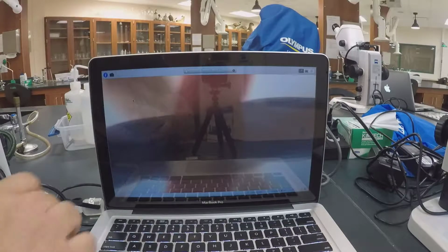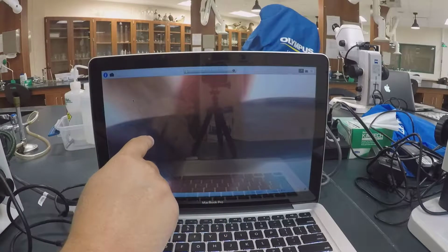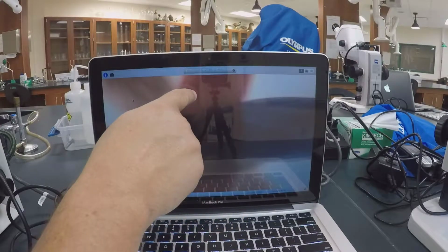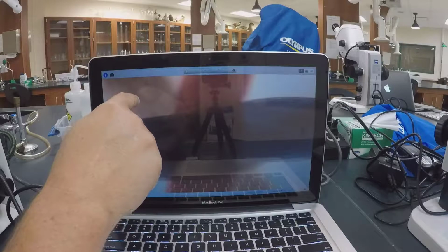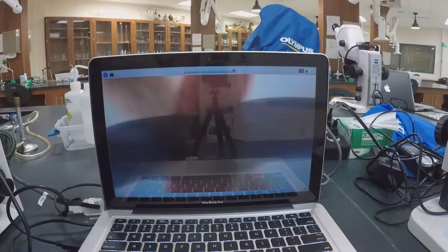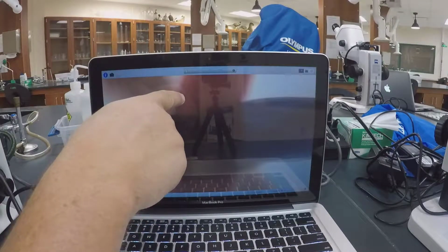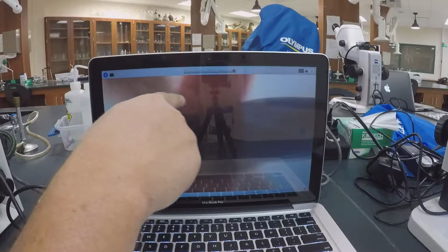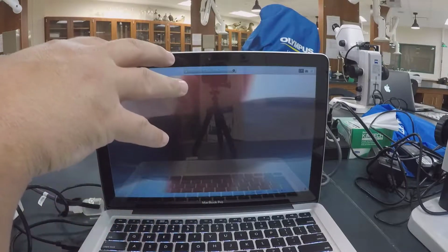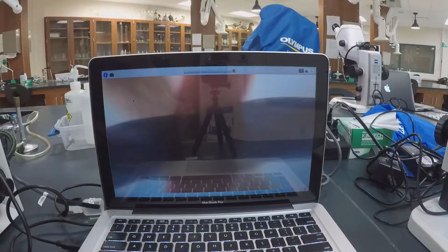But now you can see the blue string. Okay? It probably still looks like the blue string's on top because it's in focus. But now the red string and the yellow string are not in focus. So now you already know the order in which they appear, okay? But because they're not in focus, it's very difficult to tell which one of these strings is on top of the other. Okay? And so as we increase magnification, the depth of field decreases.